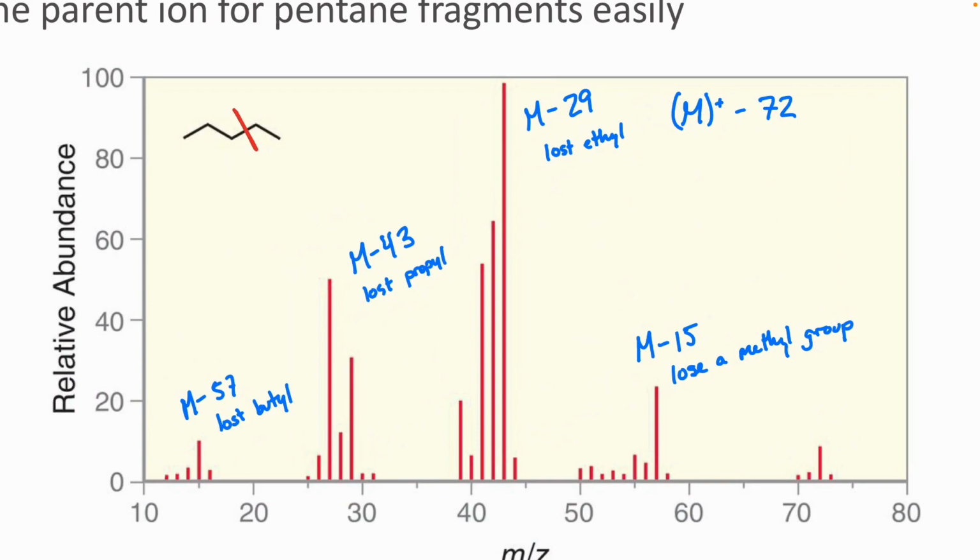But you know what does know what to make of it is a database where you can just put your spectrum in a search engine and it matches to a bunch of known molecules because they will fragment in this very specific way. Okay? So for us and our pencil and paper purposes, this molecular ion by far has the most information, but these fragmentation patterns are distinct and there is still a large amount of information in there as well. Okay?